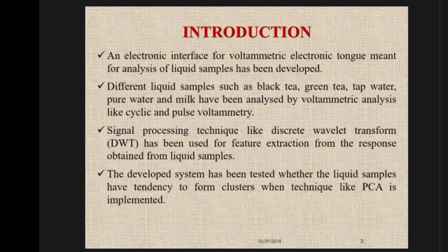So in this work, we have developed an electronic interface for a voltammetric electronic tongue meant for analysis of liquid samples, mainly targeting the spoilage detection of food samples. A few liquid samples like black tea, green tea, impure tap water, pure water from a Millipore water purifier system, and milk have been analyzed.